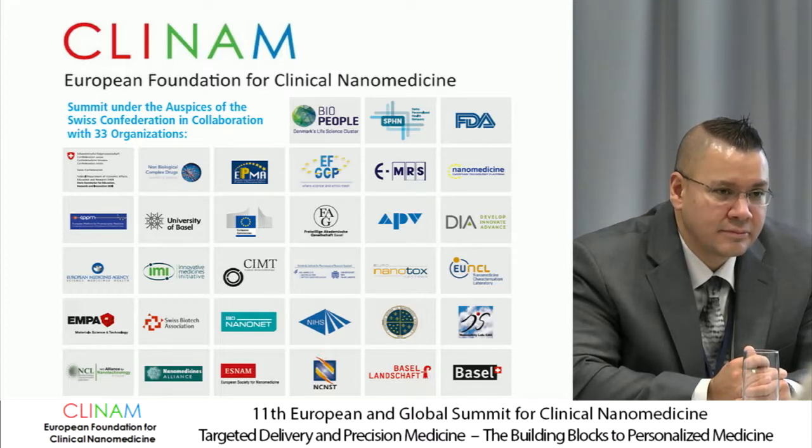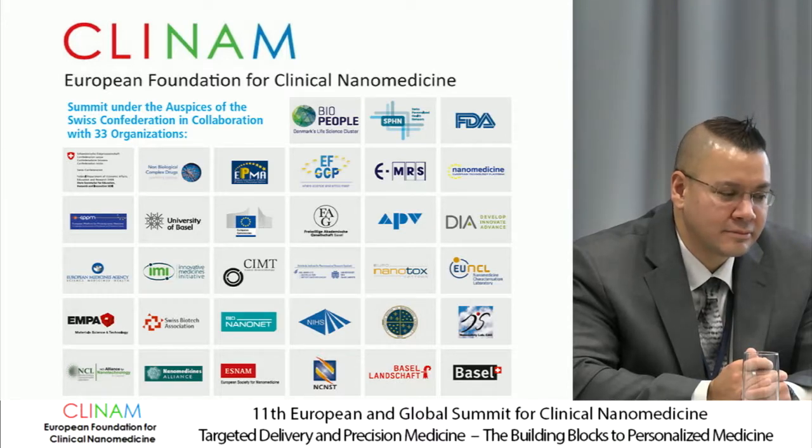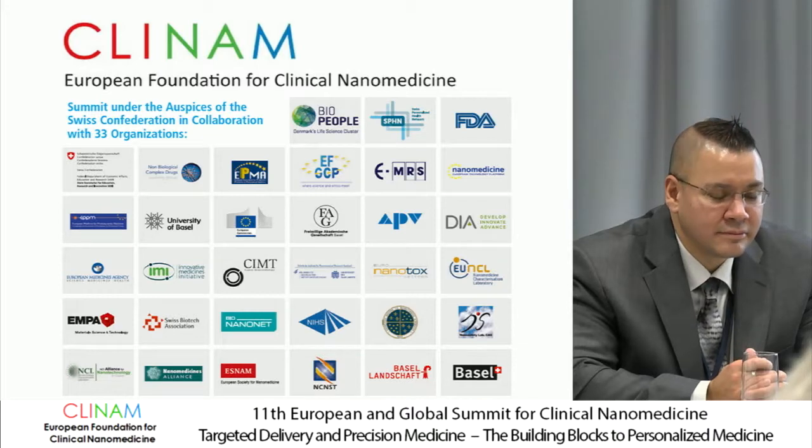You have shown very clearly that to check for batch-to-batch variability, even in cases where you don't suspect it's needed, it's really maybe needed to go further, so to really consider the particle size distribution, which is acquired by a high resolution technique, no matter which this is.